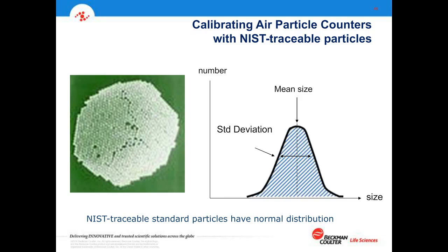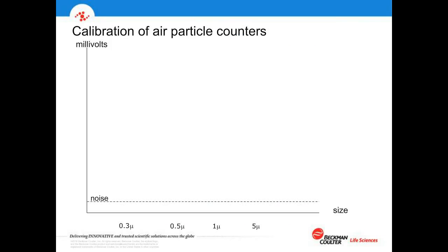So you find particles from JSR or from the American Thermoscientific Duke, what used to be Duke, commonly available, and these are concentrations of very, very precise but slightly variant particles, and the particle counter then samples these. They're aerosolized, introduced one size at a time in most cases, and we evolve a calibration curve or response of the instrument to known sizes of particles.